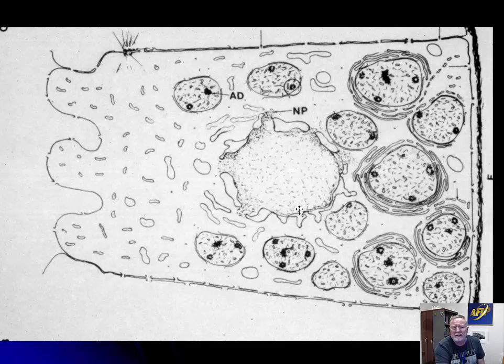We have total lysis of the chromatin. If you start to look around the outside cell membrane, there are multiple ruptures within the cell membrane which let in even more fluid. The only thing is it's still hanging on to the basement membrane, and one of these desmosomes is gone. The other one's still there. Desmosomes are really tough.